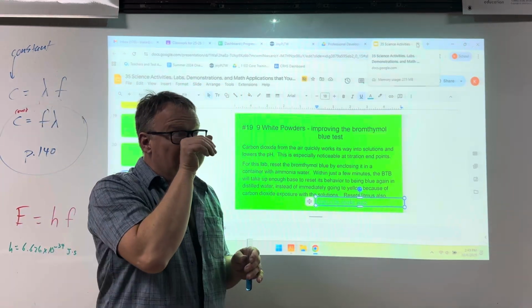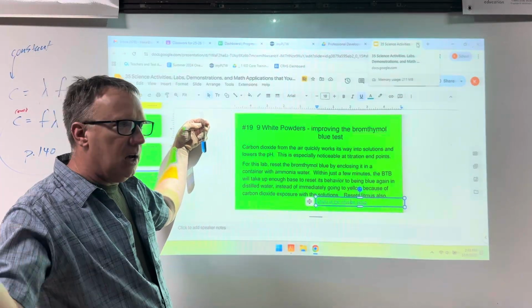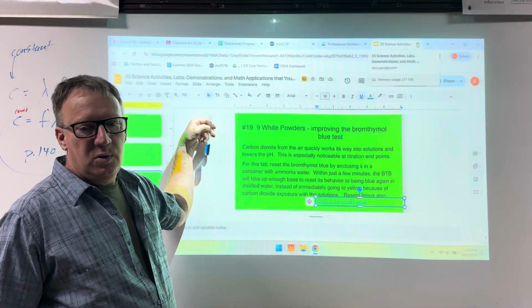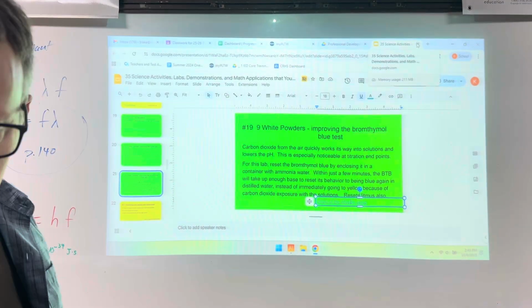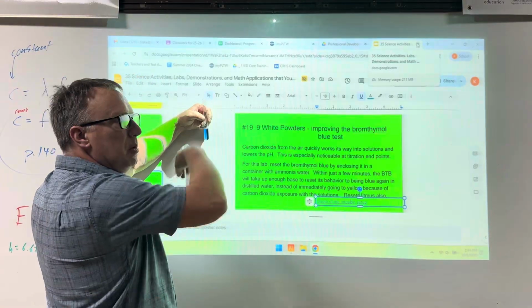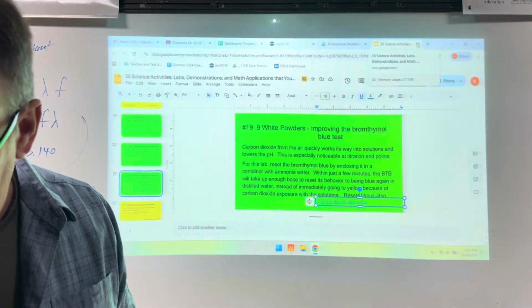And I had trouble with the lab at college, and I look back now, and it's because probably the same reason. Their bromethymol blue was already yellow because it had been opened, it got carbon dioxide in there, and it wasn't starting with the blue. So you can reset it to blue by putting it in an ammonia environment. And I don't have this prepared to do with you today, but yeah, you put boric acid in there with that, it'll yellow right up. The other ones won't. I have done that part.